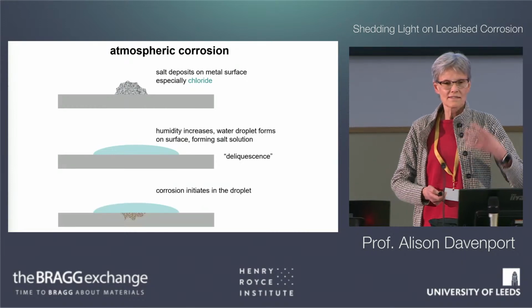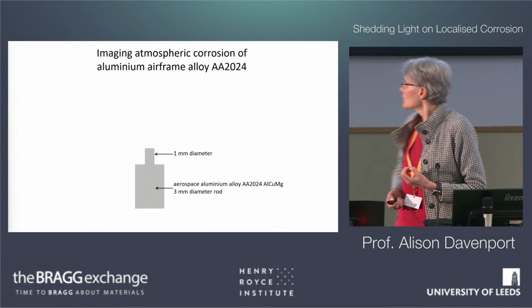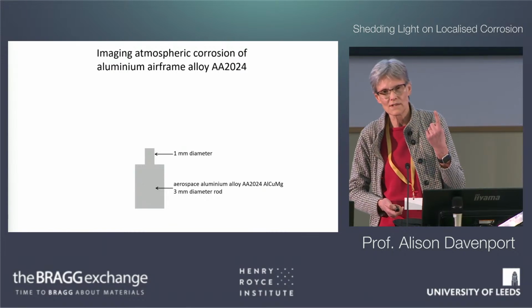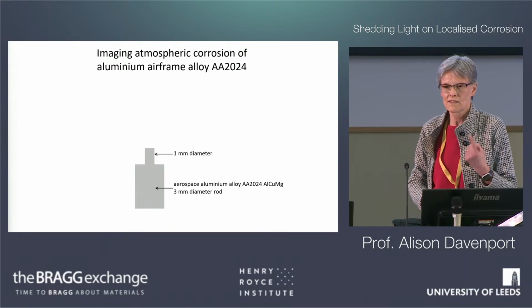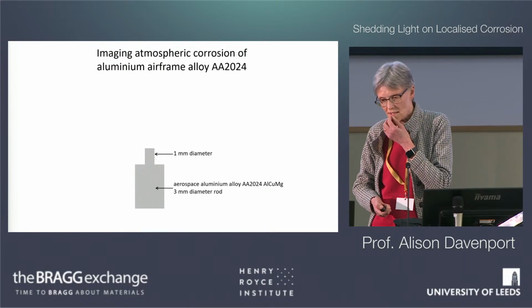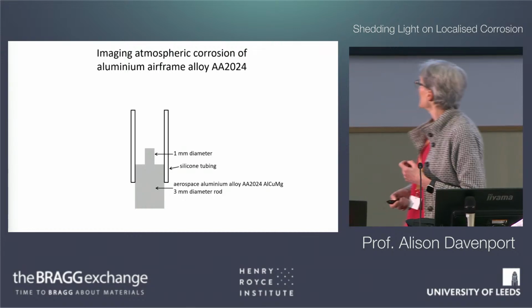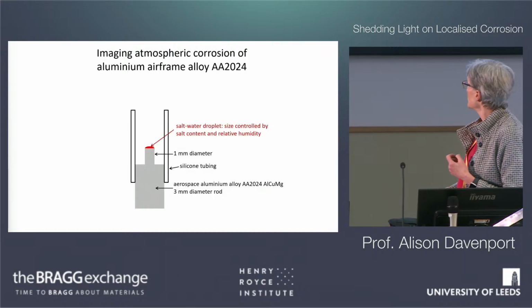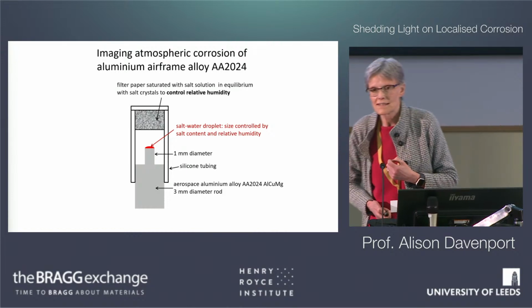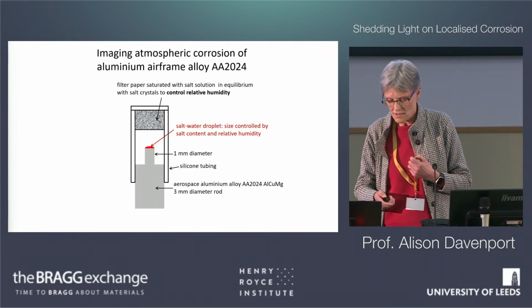So we wanted to study this process, and the way in which we did this was to take a little rod of aluminium alloy 2024, which is a common fuselage alloy, and we turned it down to a 1 millimeter pin, and then put some silicon tubing on there, a droplet of salt water, carefully controlled the humidity, and put it in a synchrotron and watched it corrode.